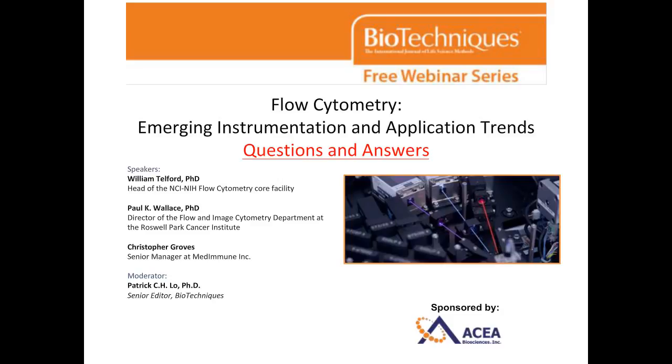Great, thank you. Paul, our next question is for you. Can you recommend a good membrane labeling dye that will uniformly label the membrane of cells? PKH26 gives very non-uniform staining of cells in culture and a patchy pattern.